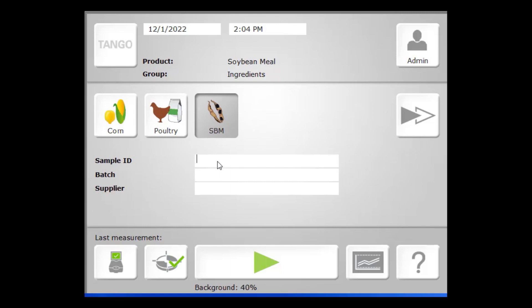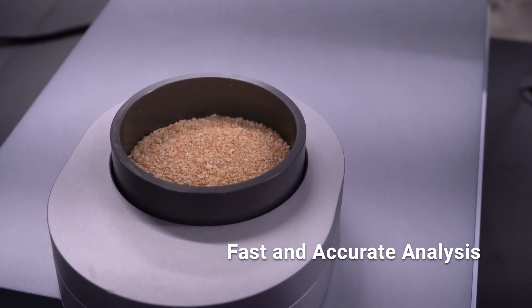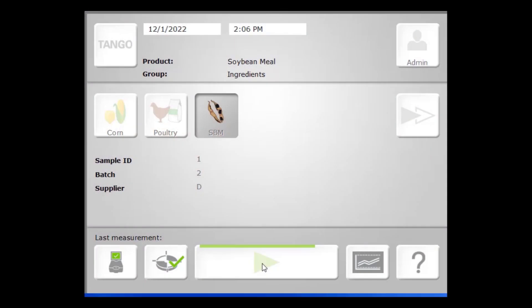Prior to sample measurement being taken, you can opt for a background measurement to be taken. However, with the Tango, this feature is automated, so the instrument will automatically close the sample window — you don't have to remove the sample cup in place. With this reference measurement, a snapshot of the environment is taken, accounting for the humidity at that point in time. While the measurement is being taken, we can visualize this progress with the green progress bar, and we can also see the cup rotating as a multitude of scans are being taken. Our software compares the average of these multiple scans against the background measurement and generates a spectral file in which all that information is taken into consideration.